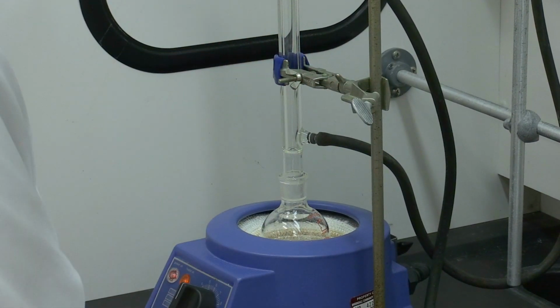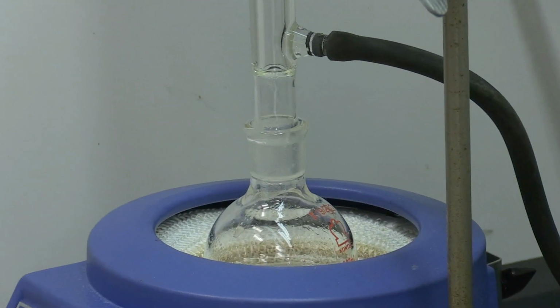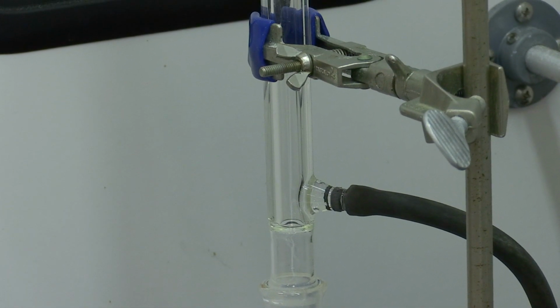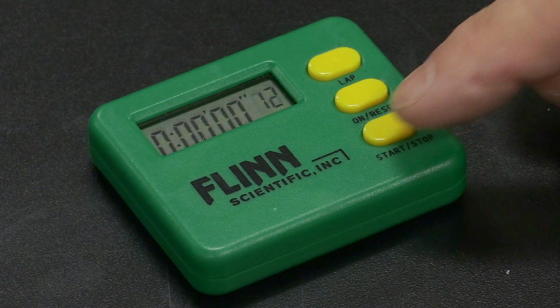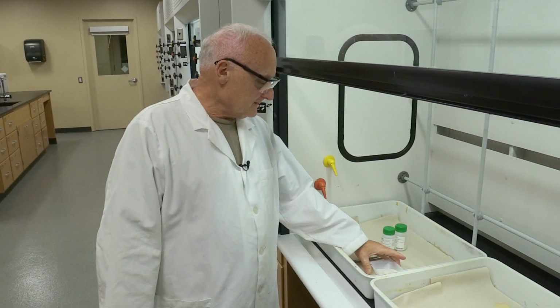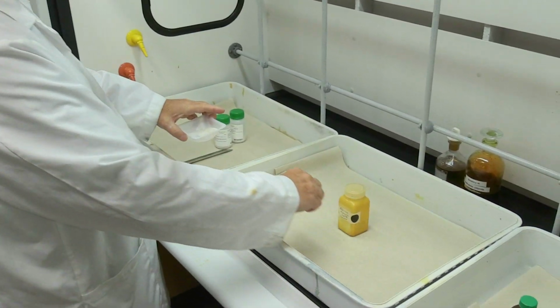And now we'll wait for reflux to take place, and as soon as that starts, we'll count our hour and a half of reflux, or 90 minutes. So this is part B of the experiment. Everything is pre-measured as before.